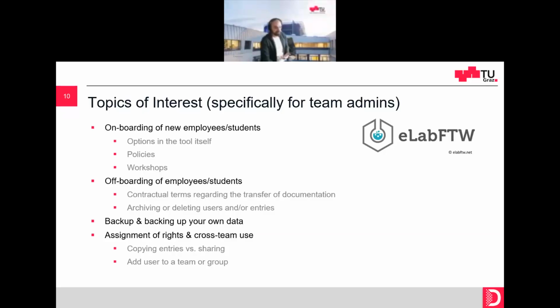There are options in the tool itself, which we did not cover today. You can also use some kind of policies which adjust regulations and rules that you set up for your team, and also workshops, maybe together with the RDM team, maybe together with me, can be organized where you can have some kind of starting workshop with your team.